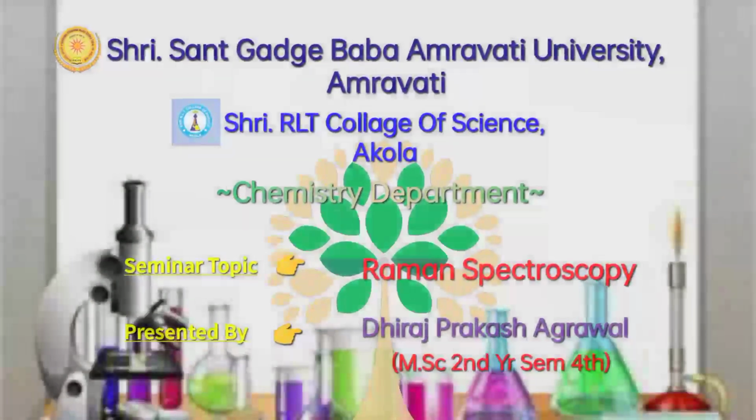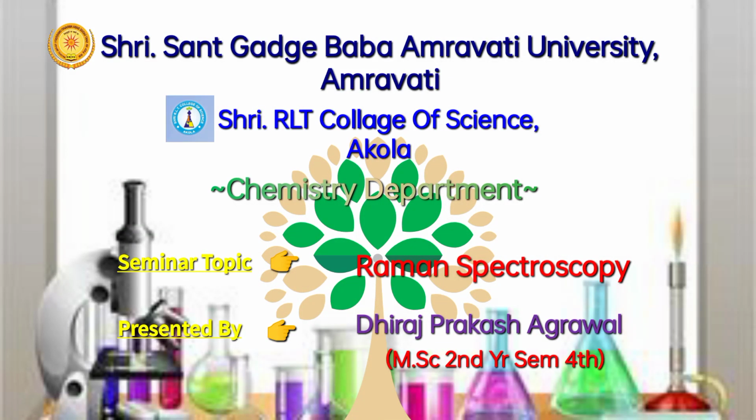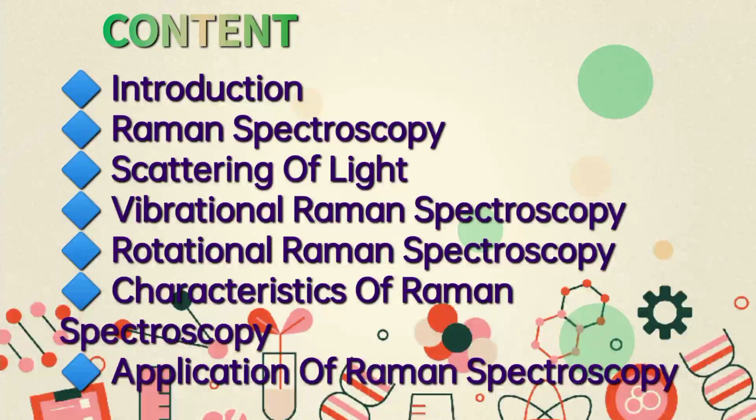I am Dhiraj Agrawal. I am studying PG in chemistry from RLT College of Science, Akola. Here I am going to give a presentation on Raman spectroscopy. In this presentation, I will give you an introduction of the Raman effect, scattering of light, vibrational and rotational Raman spectroscopy, then characteristics and applications of Raman spectroscopy.